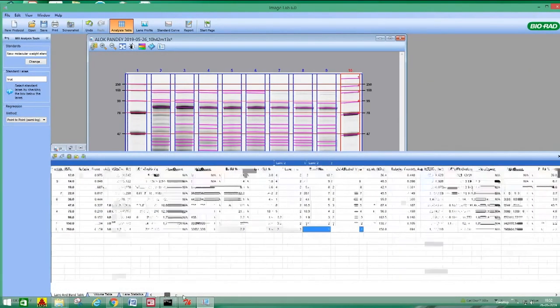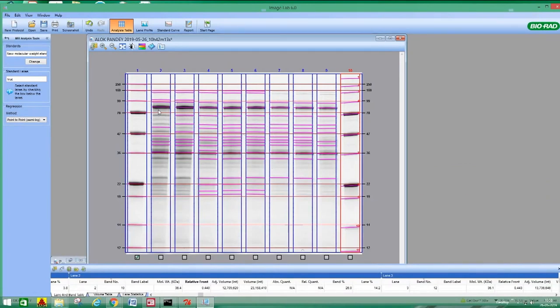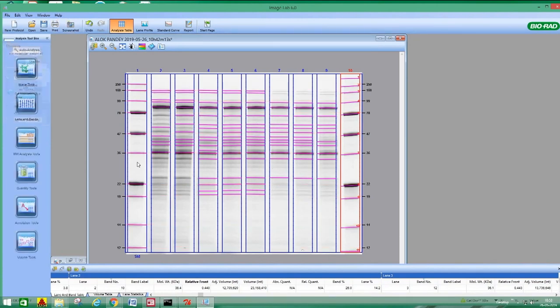If you want to calculate, suppose in lane 2, this is the fifth band I think, it will give the molecular weight. This is starting from the bottom band number, 1 to the 5th band I think. So the fifth band from the bottom is 87.4 kD. This is 78, we are calculating for this one. It comes to almost 87.4 kDa, and the relative front is 0.187. In this way you can calculate the molecular weight of your band of interest.